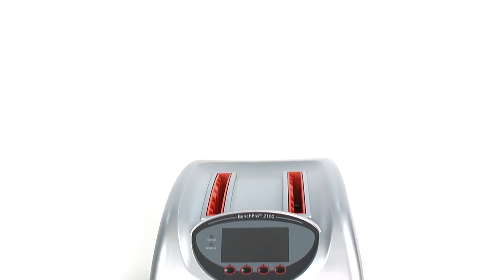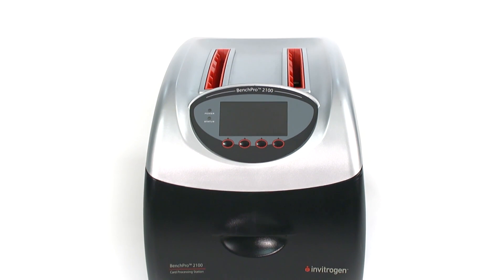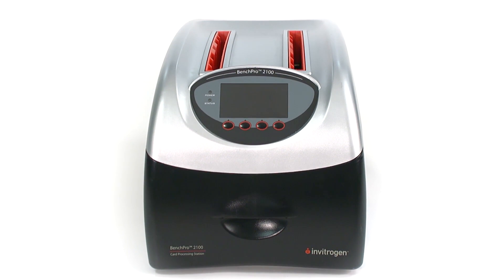It's taken two to three years to develop the BenchPro 2100. We had an idea of what we wanted to do in terms of completely automating this process. The main consideration was to eliminate any human intervention steps in doing this process.